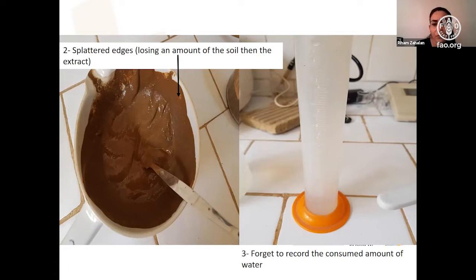Another mistake is forgetting to record the consumed amount of water, or forgetting some necessary weight, as we mentioned before. We need to be very careful, because we don't want to repeat this procedure once more.